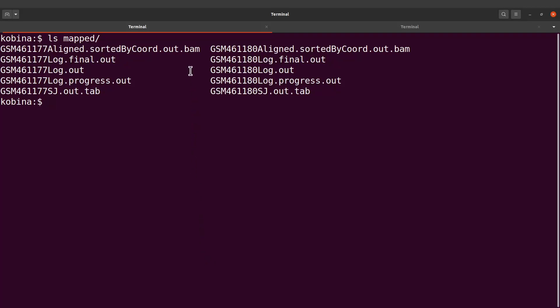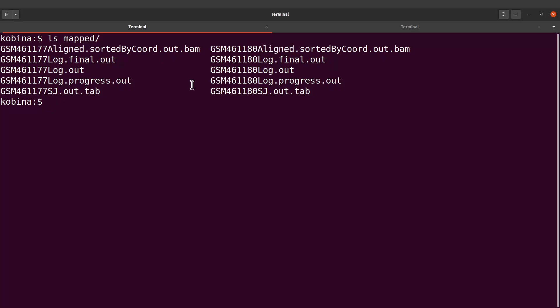What we are going to do is use the BAM files. That's what we are going to do for the next activity.